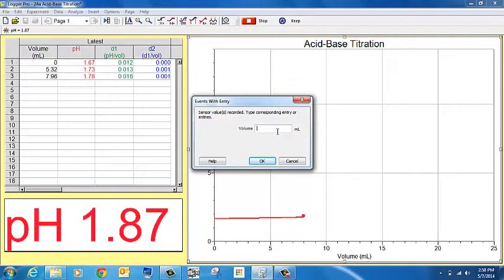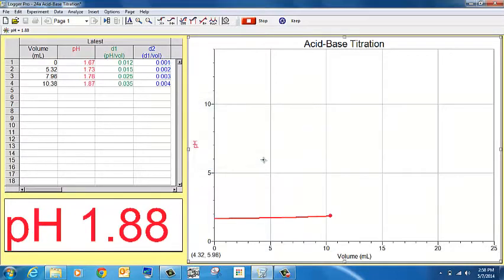If you have to refill your burette, then you're going to have to add the new volume to the old volume that you dispensed from the burette. At this point in time, I've got about, let's see, 10.38 milliliters. 10.38 milliliters. I'm going to press OK. And you can see that the line is slightly beginning to curve up.